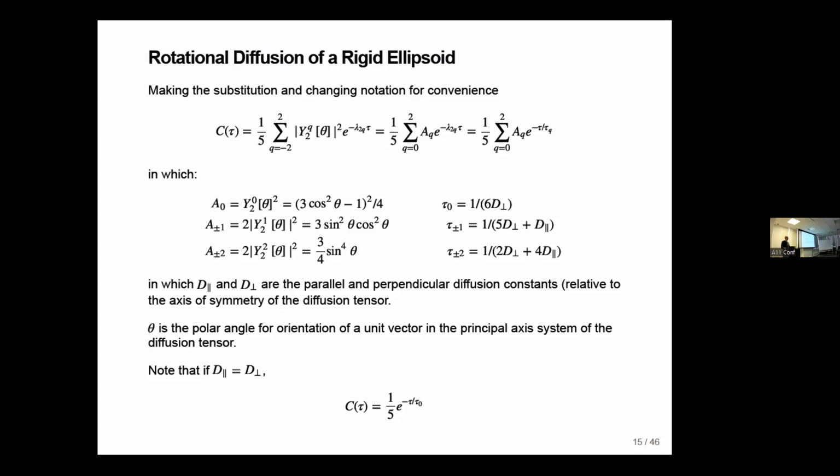And if you go to other spins, the situation can get even worse. You saw from Anne that the CSA for a carbon in an aromatic ring has a unique axis orthogonal to the ring, and perpendicular then to the dipole interactions. So there the problem gets to be even worse, and not even approximately in the same direction.